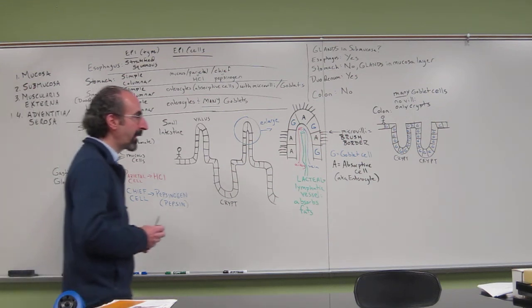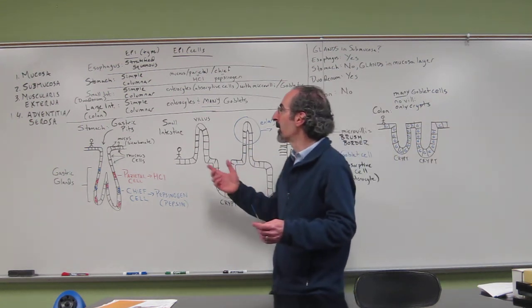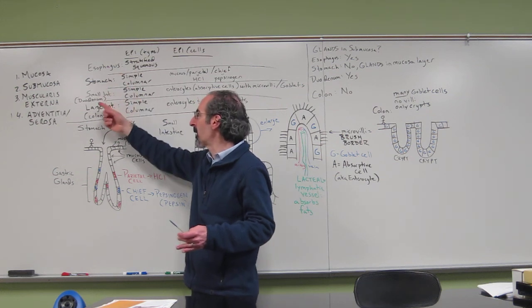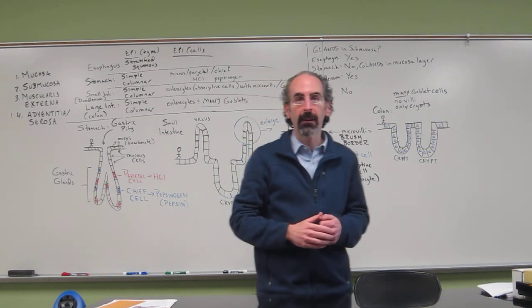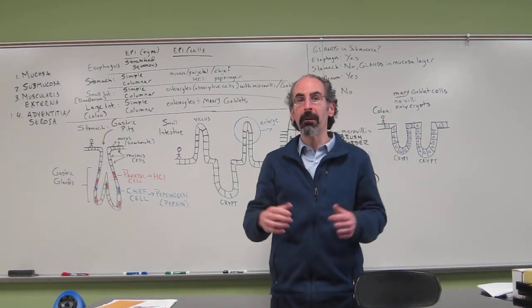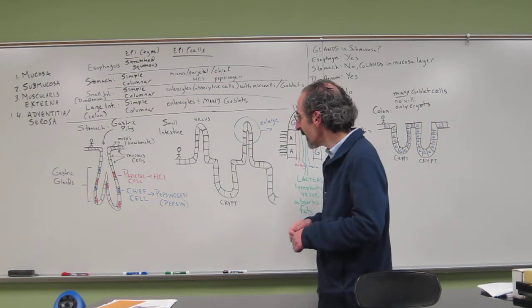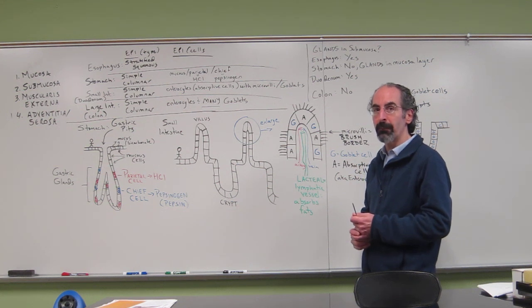What I would do when studying is try to give yourself either a histological view of the esophagus or the stomach, the duodenum or the colon, just a blank slide, and try to identify what it is without knowing in advance. Just make some cards or pictures or mix them up randomly. And try to use some of these features to help you distinguish one from the other.